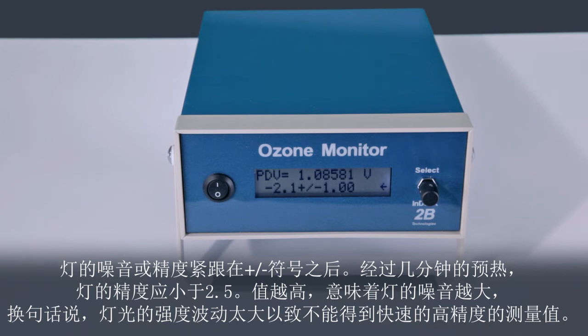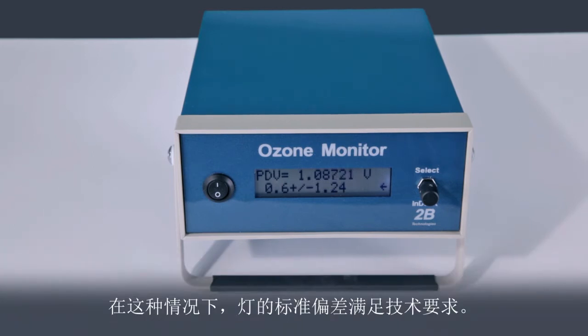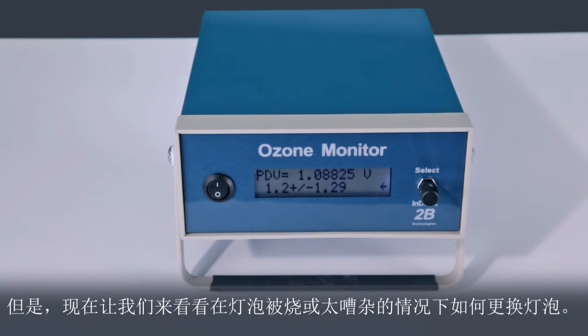A higher value implies a noisy lamp. In other words, the intensity of the lamp is fluctuating too much to make fast measurements with high precision. In this case, the lamp standard deviation meets specification. Let's now see how to change a lamp in the case that the lamp is burned out or is too noisy.